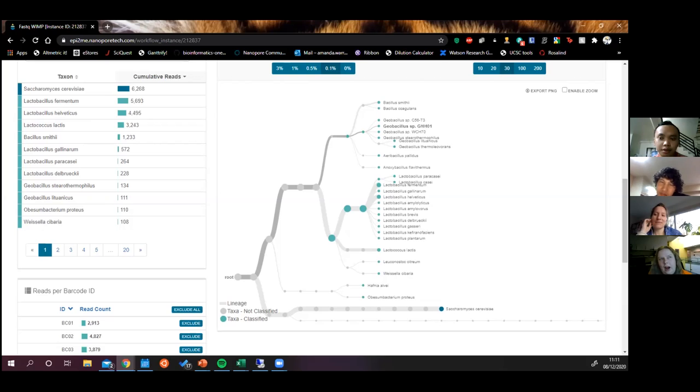I think I'm an advocate for whole genomes, just because I don't entirely trust 16S and similar things to be as accurate, although it depends what database you've got. If you have the data for all of the whole genomes, then use the whole genomes. If you've got a more extensive database for a marker gene, you may as well use the marker gene. It's really up to you. You could try it with both, see how it looks and compare them.